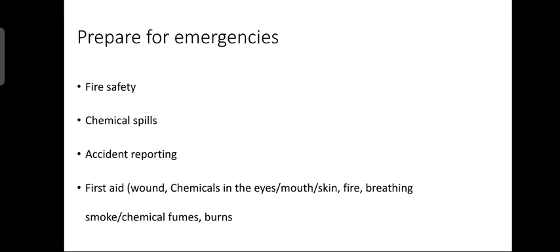Use an appropriate extinguisher. Dry powder for all types of fire. Dry powder containing extinguishers are recommended to put out all types of fires. Carbon dioxide for B and C type fire, because the use of dry powder leaves a messy surrounding. Carbon dioxide based extinguishers are often recommended for small fires of chemical origin. Switch off power supply and AC units, inform substation.